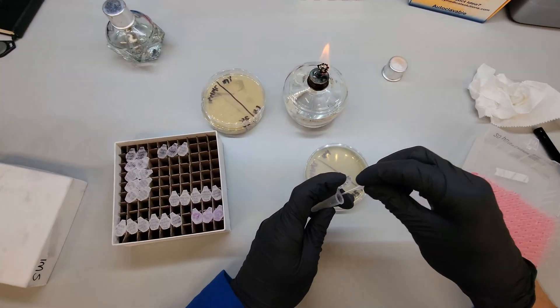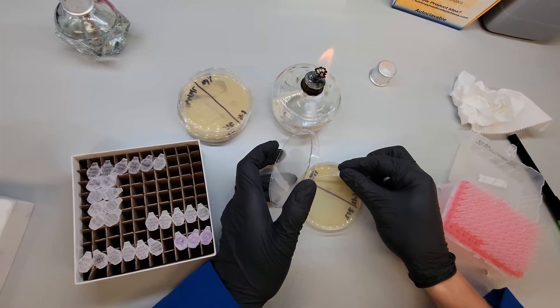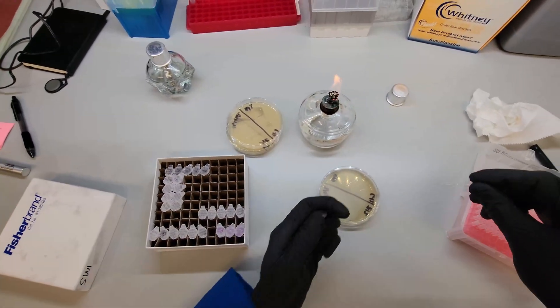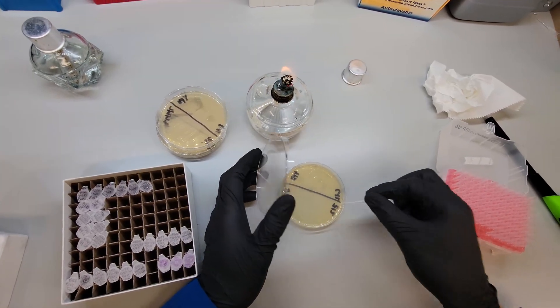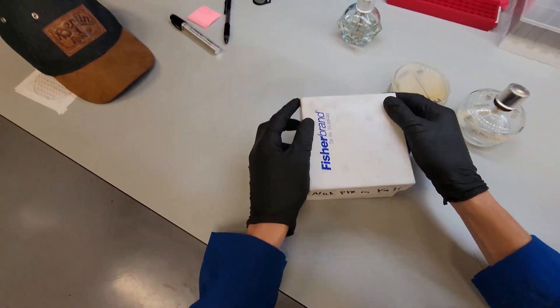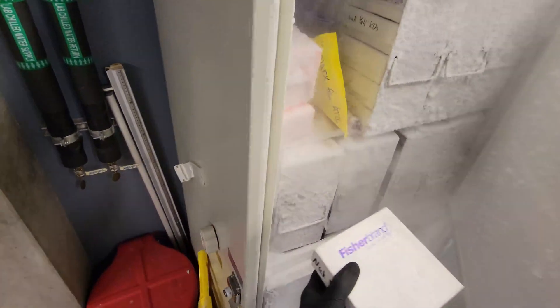Here's B12, Z12 — do that one. Z12. So we can cap that. Let's put this back in the freezer first — we don't want to let this thaw very much. The freeze-thaw cycles are probably kind of bad for the glycerol stocks. I've never noticed an issue with freezing and thawing glycerol stocks, but better safe than sorry.